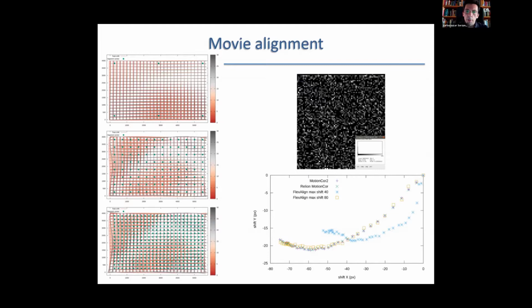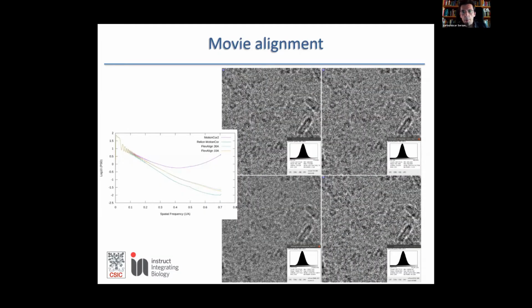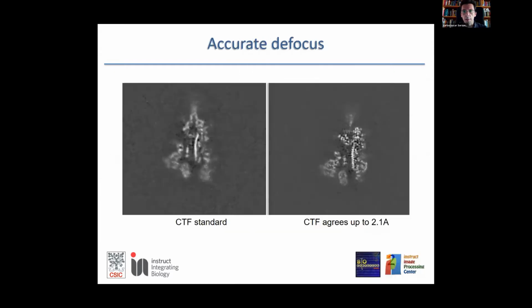If you don't care, if you just want to produce a result and have a rough estimate of what is happening, then you can use any one and be happy with the result. The same happens when you pay attention to things like the power spectra, how it behaves with frequency, or histograms, which are not all the same. You need several algorithms to make sure that what one is computing is the right thing.